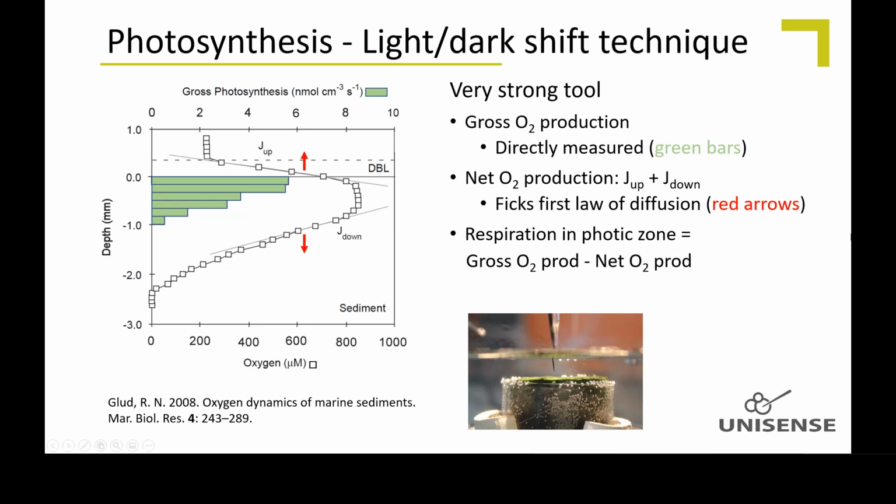Thanks. You're welcome. Can I leave the underwater meter for 24 hours or even longer? Yeah, you can do that. I don't quite recall the battery hours. I think it's about 20 hours battery or so. It depends on the temperature, of course, but you can have an external battery as well, so it should be possible.